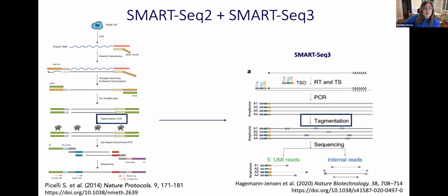And then we are going to perform a tagmentation, and this is the instance in which a very similar Tn5 transposase is introduced into the SmartSeq2 reaction. As I mentioned, in SmartSeq3 this happens more towards that reverse transcription step, but in SmartSeq2, we have this Tn5 transposase that catalyzes the in vitro integration of these oligonucleotides. Finally, we're ready to sequence, and then we are ready to analyze after.